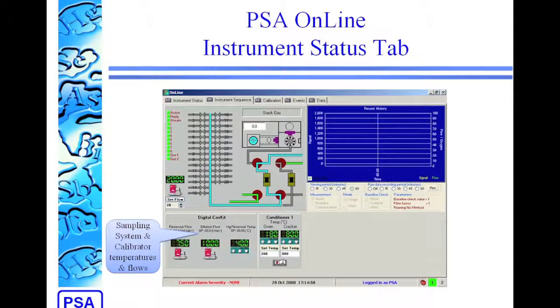At the bottom of this page, it shows all of the calibrators and things that are connected to the system, so it can see the temperatures and flows. A lot of the time, you can also alter the temperatures and flows through this interface.